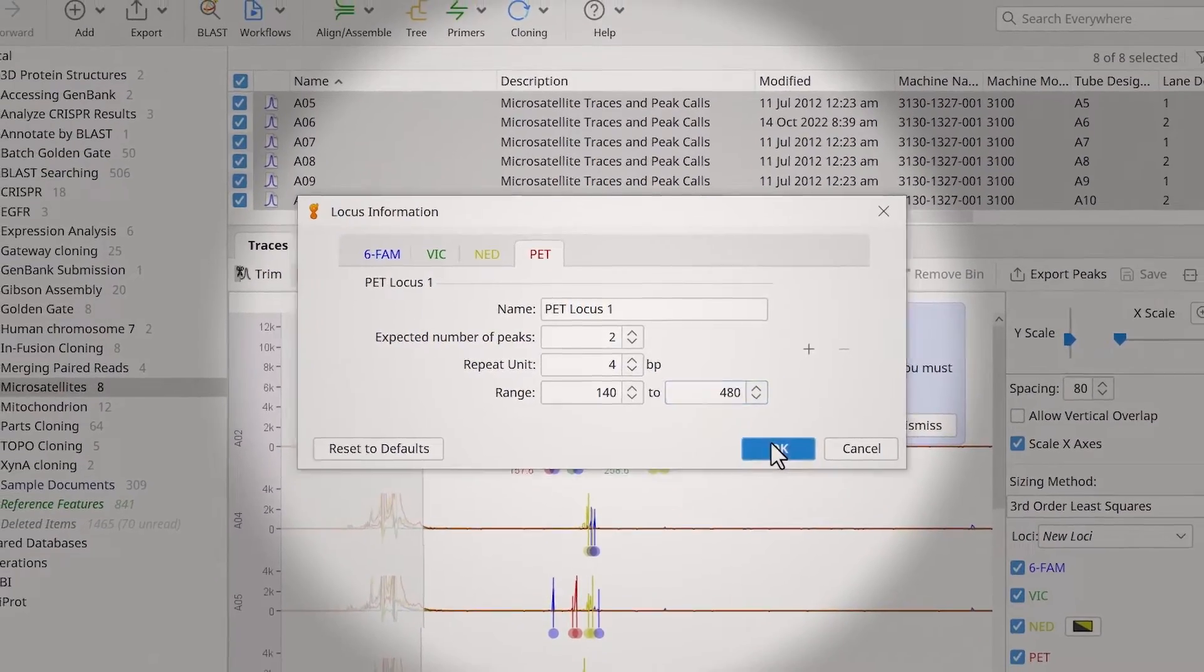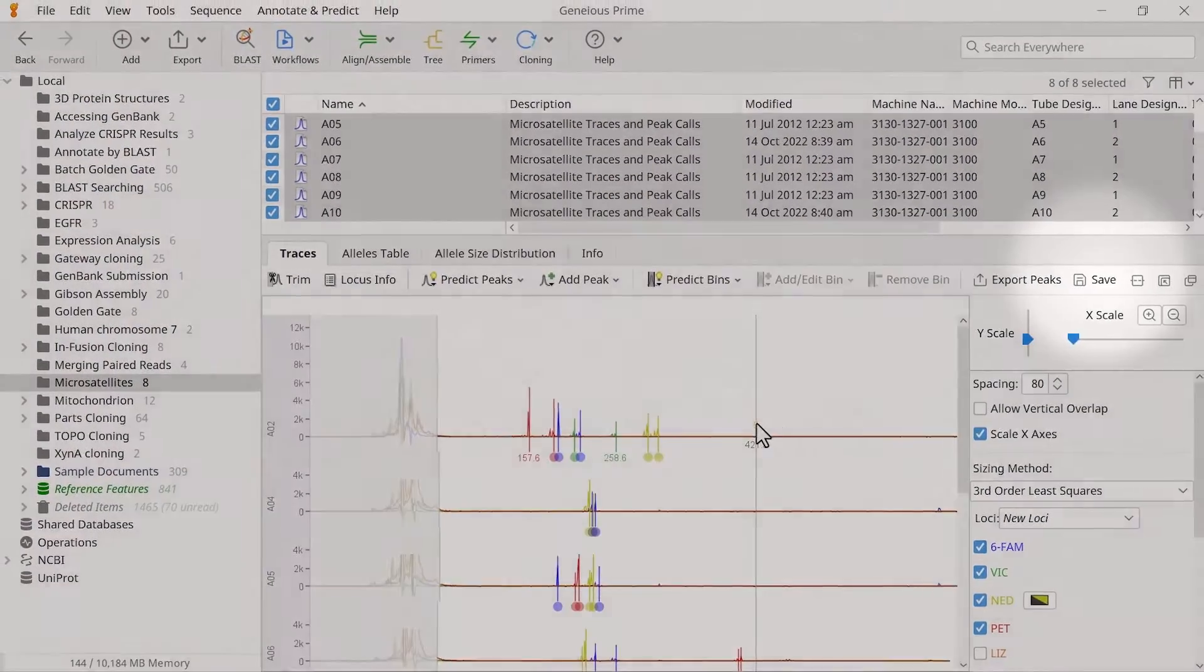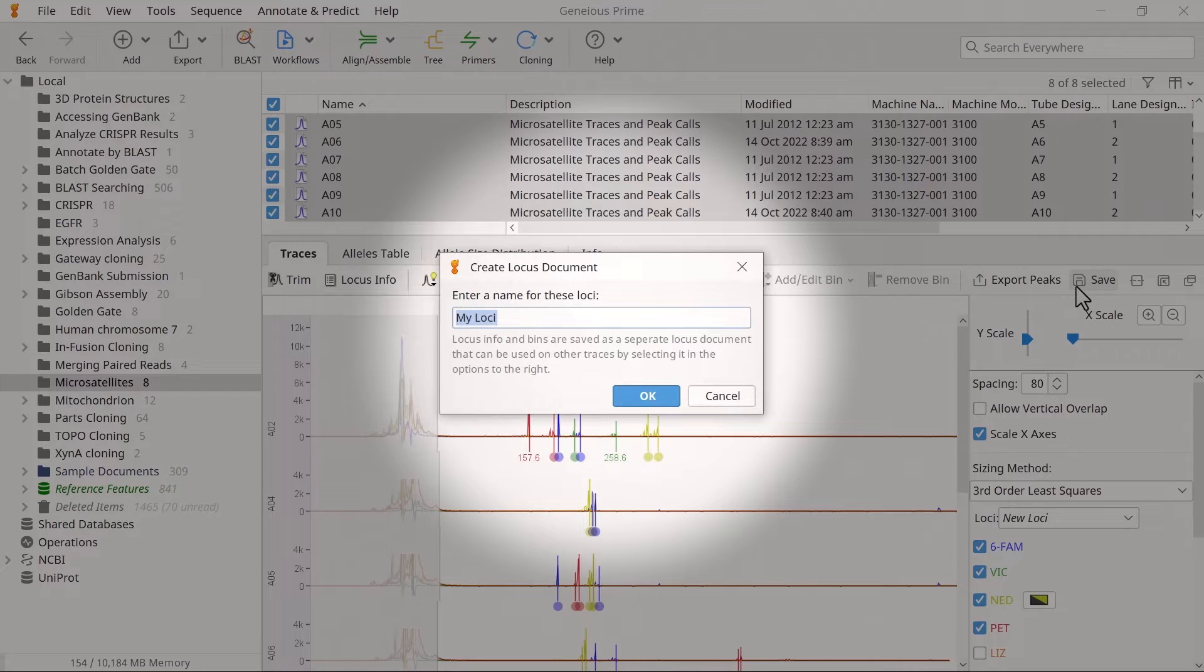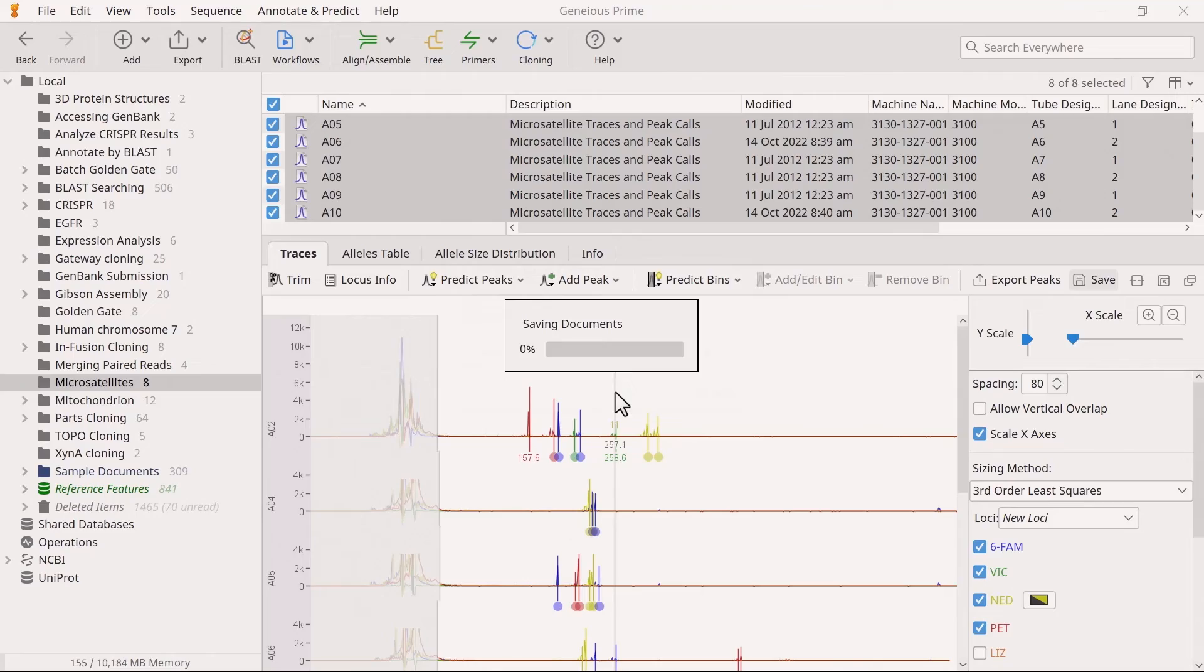Once finished, click OK. Then click Save to save the loci as a new file. Ensure you give the loci a suitable name.